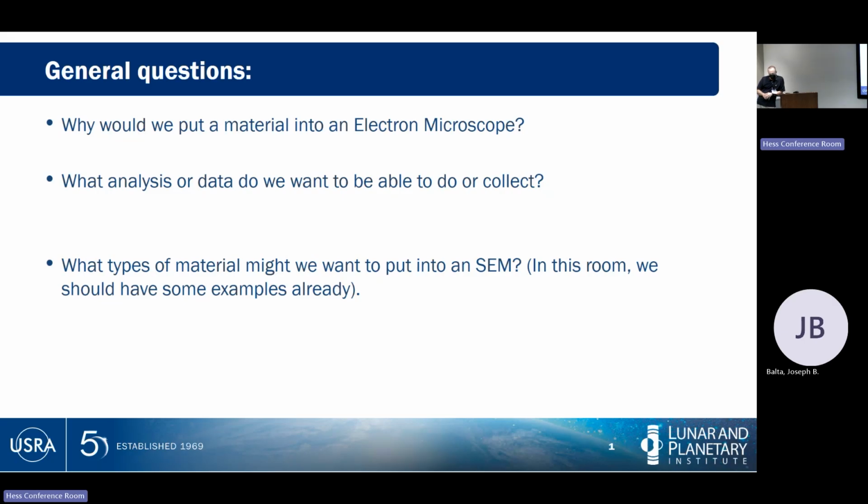And well, that means we're probably going to be looking at a precipitated compound that has some amount of crystal structure. It's going to be an organic material. It's going to be tough to analyze anything in the chemistry about that on a standard SEM, but that might mean we can still get something about the structure or patterns of crystallization or anything else like that out of this, okay?